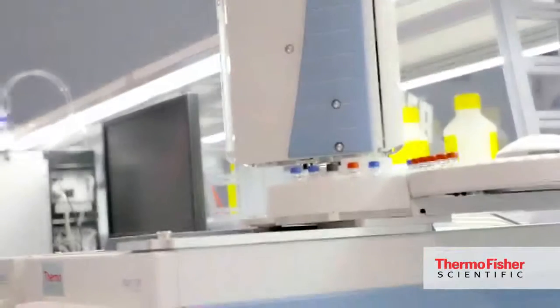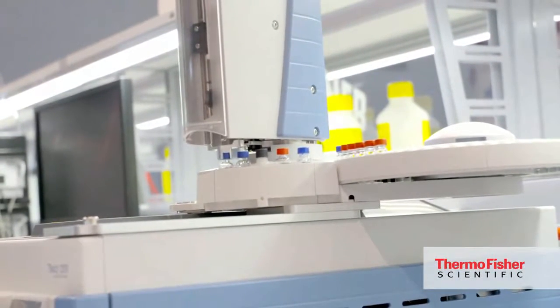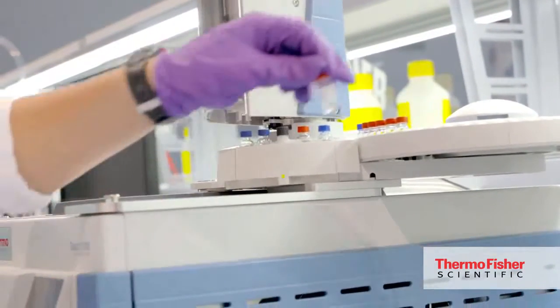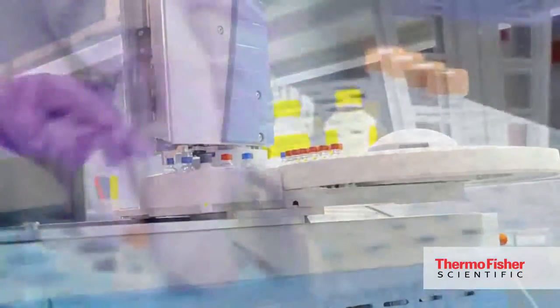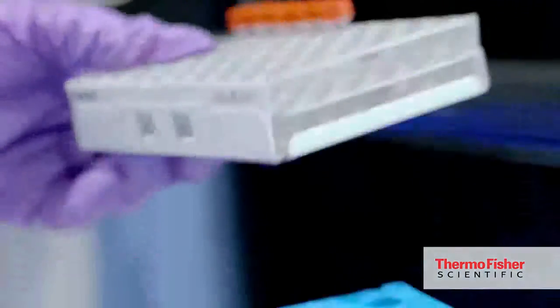So we are injecting in both LC and GC MS systems. First, we just put the sample into the GC tray. So the other sample will be put into the HPLC autosampler.